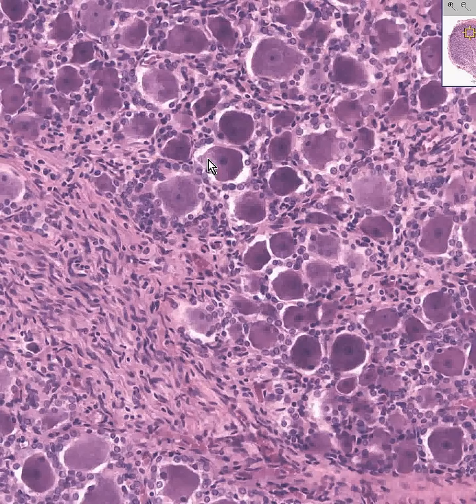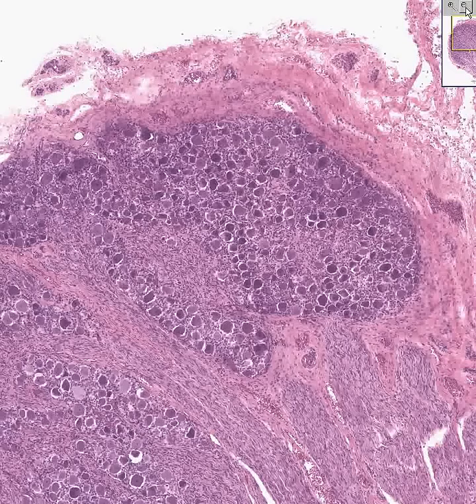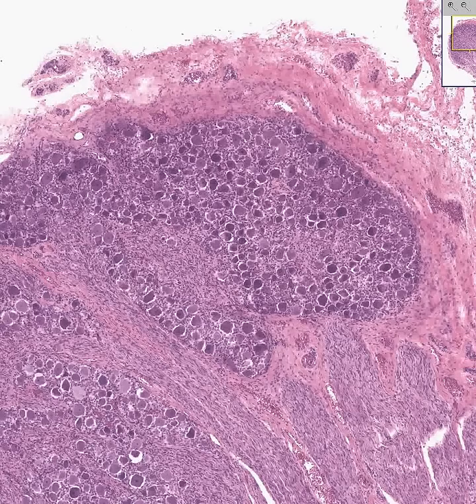All this granular stuff is Nissl substance, which is RNA. And there's usually a huge nucleolus, if you're lucky enough to cut through it. In fact, the general principle is that the nucleolus of a dorsal root ganglion pseudo-unipolar neuron is about as big as the whole nucleus of the surrounding satellite cells. There's perhaps more nerve along here, and some fibrous tissue supporting the whole thing. This is your classical dorsal root ganglion, and yes, there's a lot of fibrous tissue here as well.